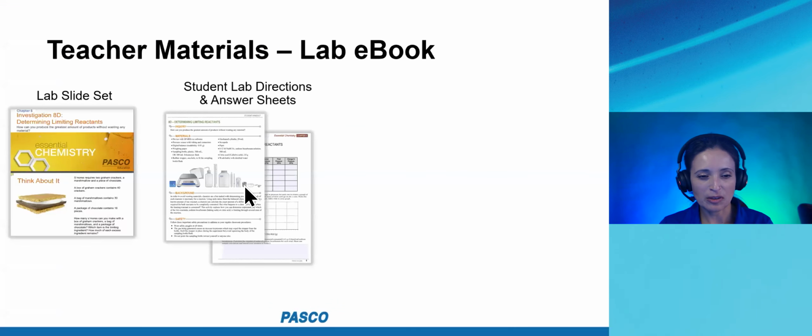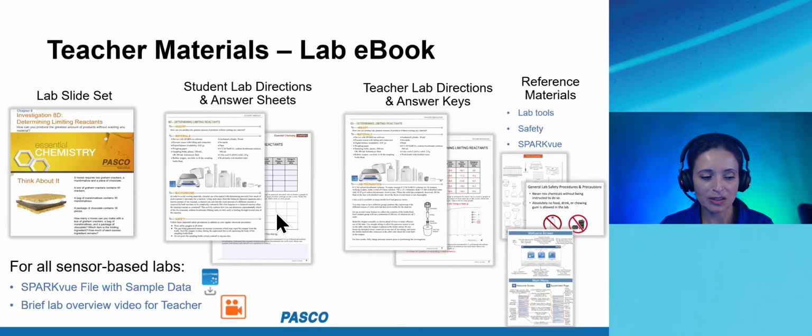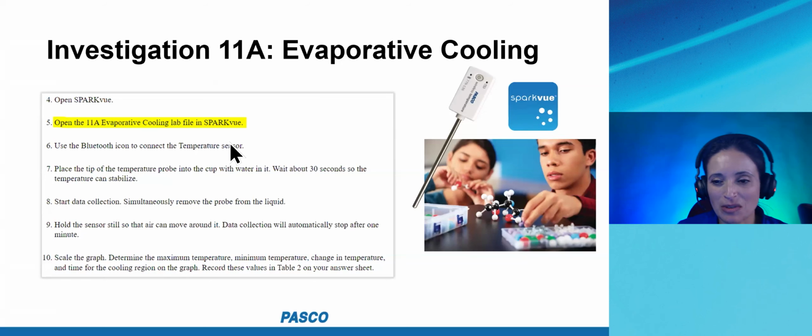All right, I already went through these items: answer keys, reference materials, and where to get videos, all covered already. So now we can do the lab. The first lab we're doing is the evaporative cooling lab. I chose this one because I like starting with the temperature sensor.